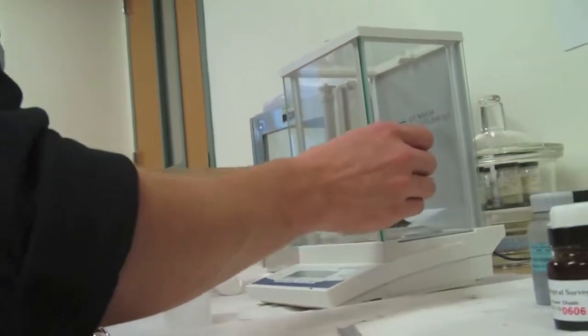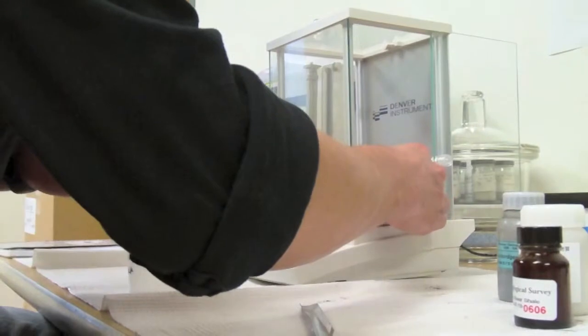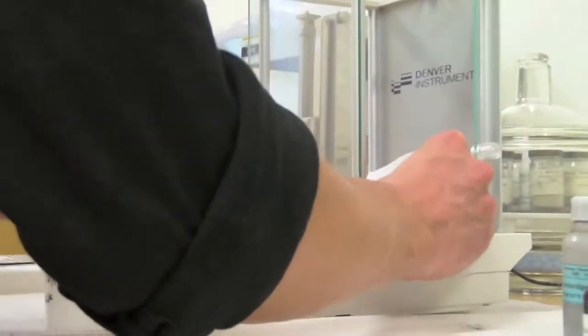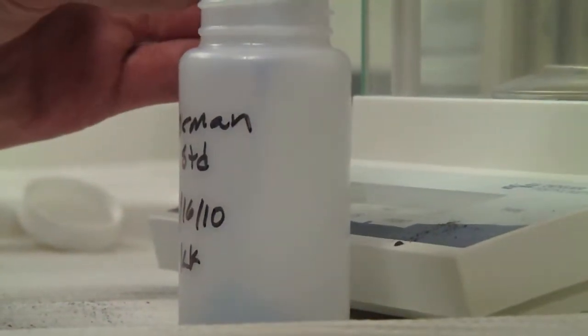Okay, we weighed out the sample plus or minus point zero zero one grams. Now we take it out of here and try to spill very little, or none at all. This is probably the goal. And we put it into one of these things, the German standard.